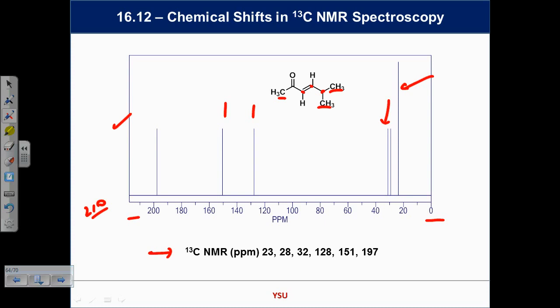The problem with this spectrum is there is one signal that would not show on a proton spectrum. The carbonyl, right here. There is no proton there, so it's not going to show. So that carbon now seems to be all the way down here. It's about 200. You look on your chart, ketone and aldehyde carbons are all the way down at 200, a dead giveaway. Ester carbons, 175, a dead giveaway. They're always there in the same place.